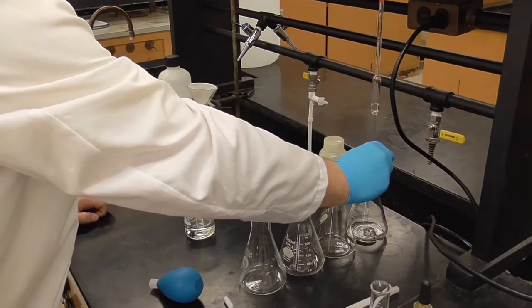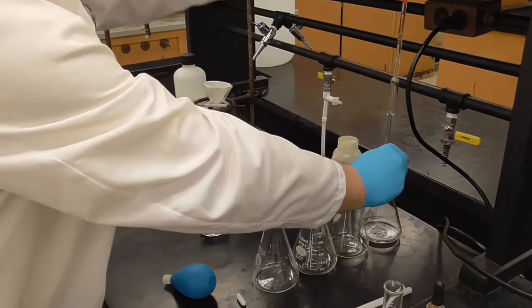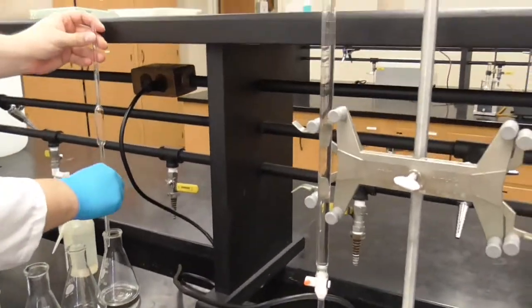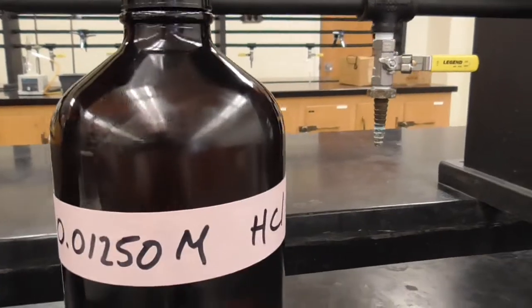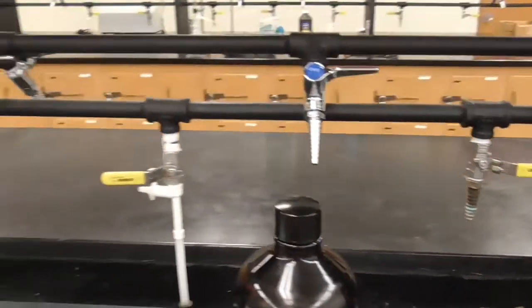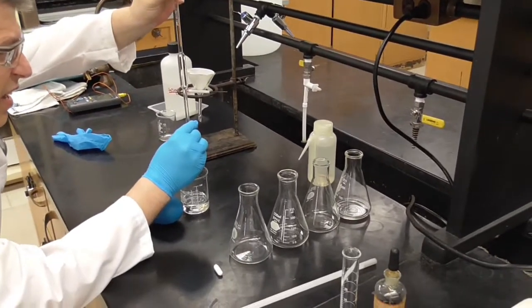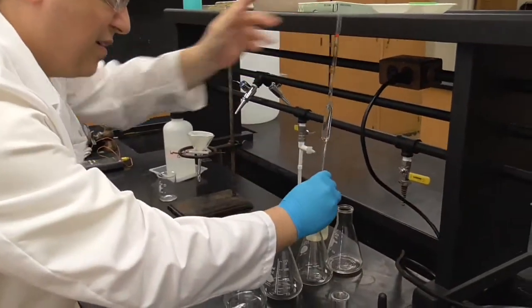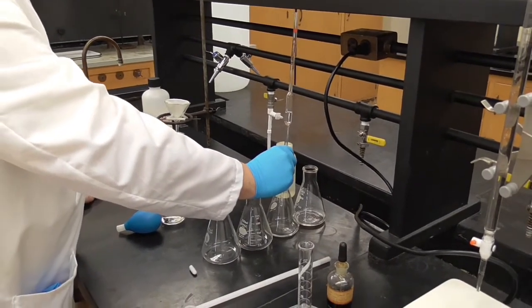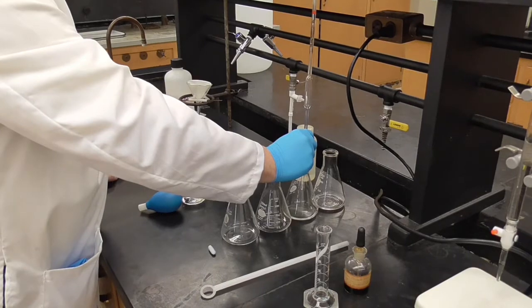Now, before we started doing this, we cleaned, rinsed, and filled a burette with HCl, so you can look at that. And Dr. Velkamp, who is our camera person, is going to show you the concentration on the stock bottle while I'm pipetting. That's the HCl that's in the burette. We're going to do 4 titrations of this saturated solution at this temperature, and then we're going to do the ones at the high temperature.